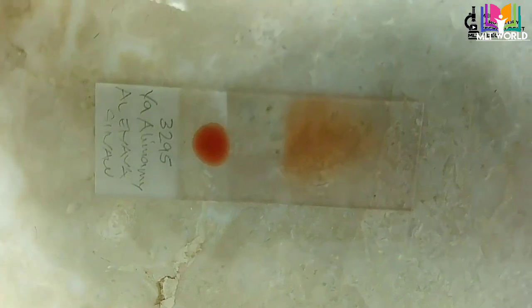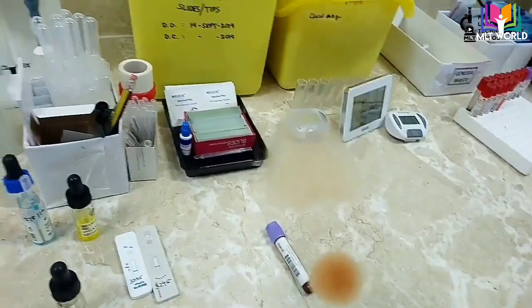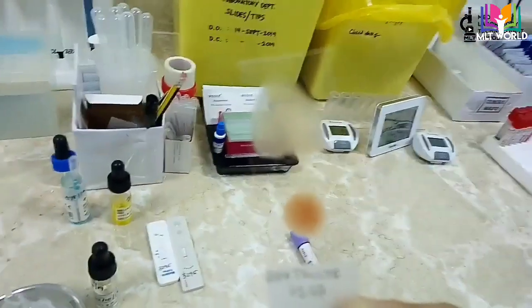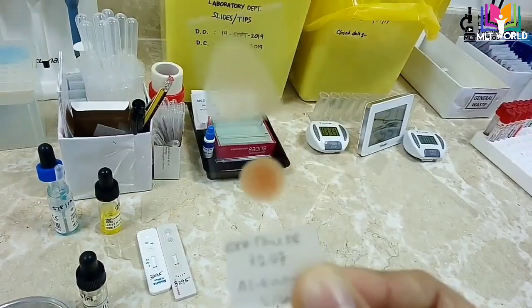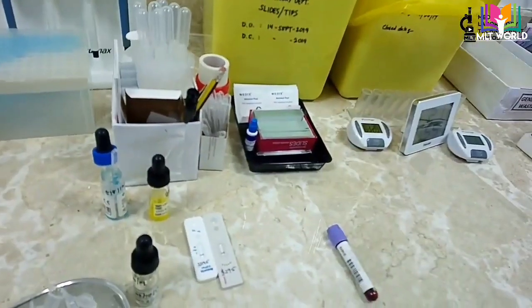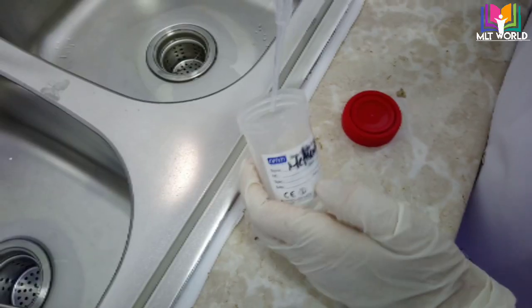Now I will adjust the light so I can show you the smear. You can see the thick and thin smears are ready. You have to dry the smear properly first, because only once the smear is confirmed dry can we fix it with methanol.